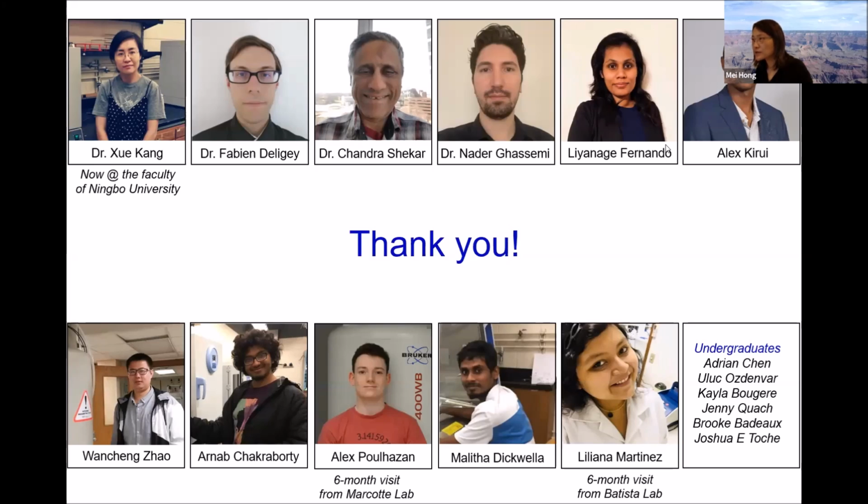Next question is by Alon's Lens. Did you try to record INEPT-based experiments to probe more dynamic parts of the fungus? Yes, we have done this, but most of the signals come from the intracellular components. So small sugars, lipids, and something else. So we care more about the structural component of the cell wall part. They are rigid.